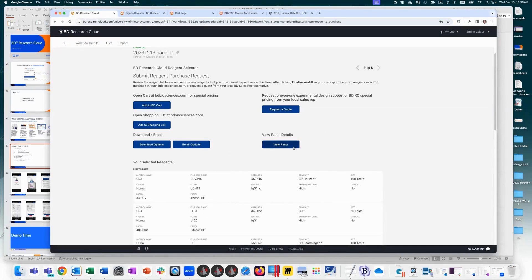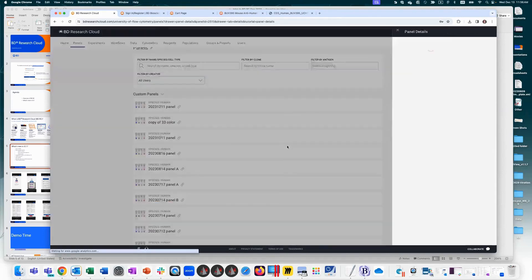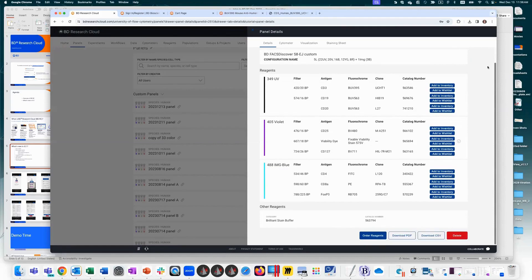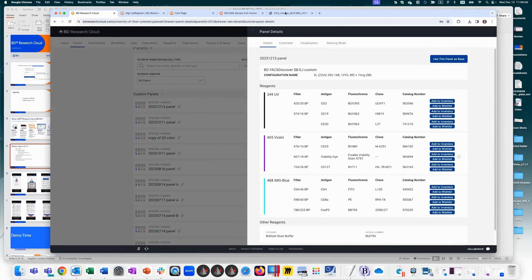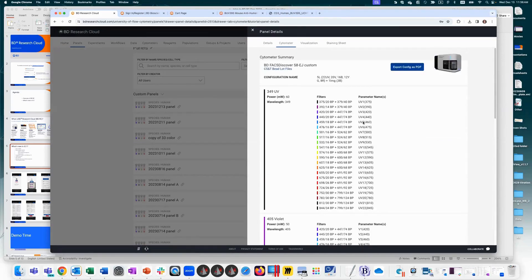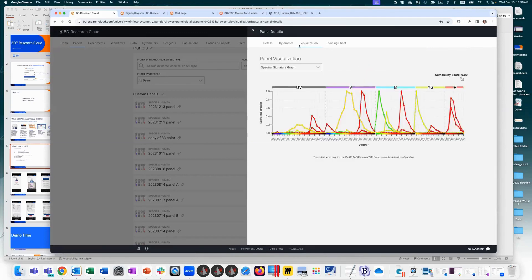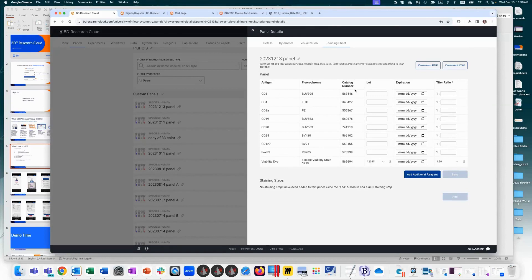After clicking 'View Panel Details,' your finalized panel appears back in the panels section under custom panels, showing the cytometer details, the visualization tool for spectral characteristics, and the staining sheet. The staining sheet automatically pulls in lot and titration information for reagents already in your inventory.